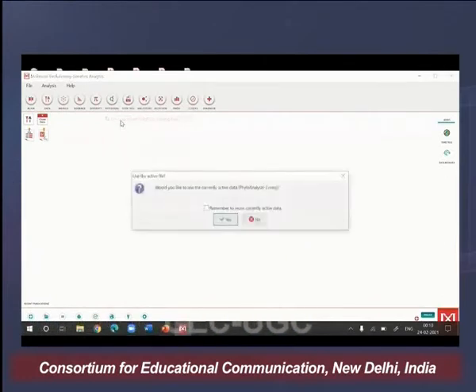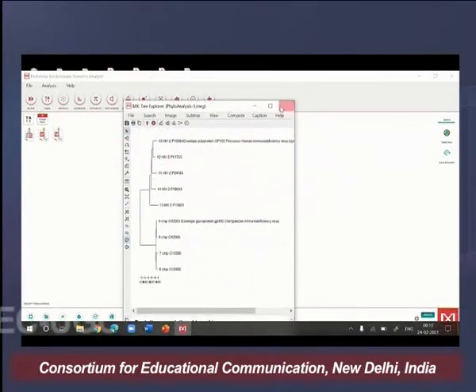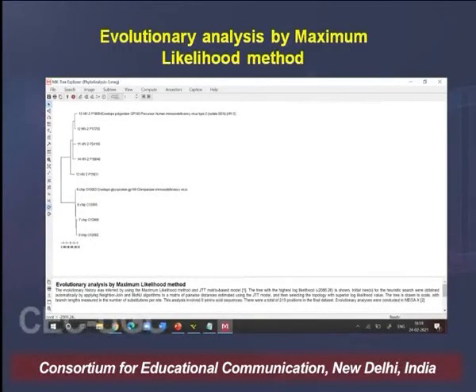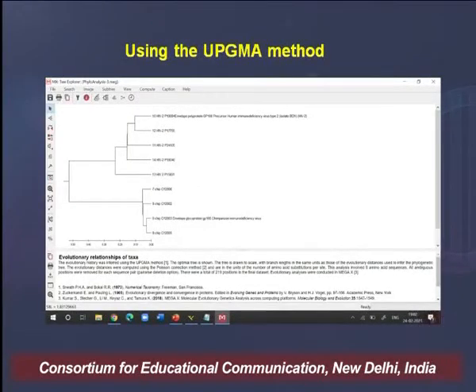This MEGA software also allows you to select data online, meaning it will allow you to search the internet sources, then you can go to NCBI, or maybe you can go to other protein sequences, and then you can directly select the sequences and run your data. So, here is a tree which is drawn by maximum likelihood method, and you can see that we could make 2 clades. Our data belong to 2 clades and it made a clear 2 clades. But with the MP method, we do not see 2 clades here, and with the UPGMA method, we could get 2 clades, and it just did fine.